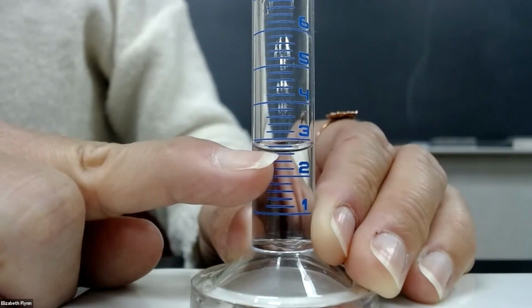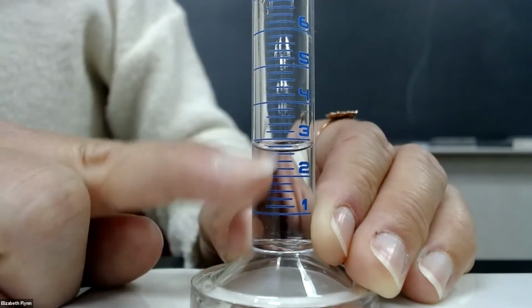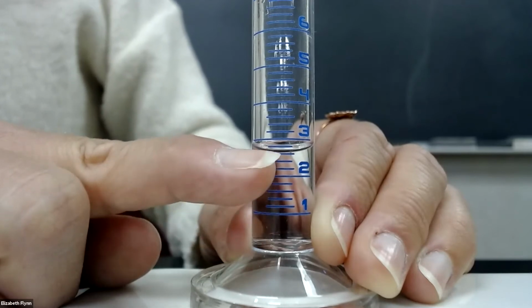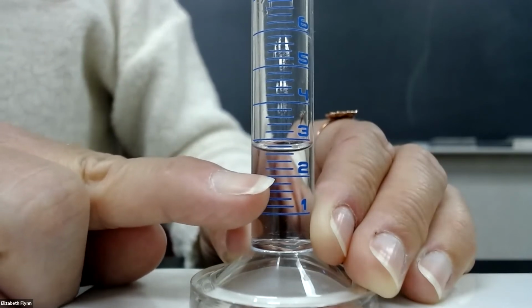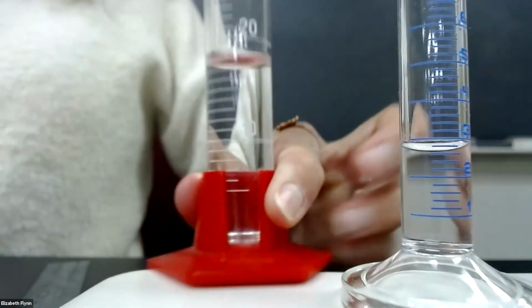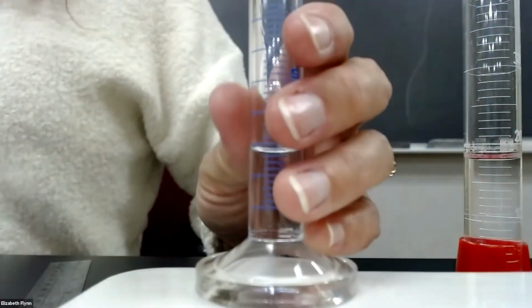2.7, right? But we can't go any further out than that because that's the first time that we are estimating the digit. So these graduated cylinders aren't as precise as other 10 milliliter graduated cylinders. You're still only going to be able to report the 10th of a milliliter. So the measurement that you write down, though, is the one that we had before that was exactly on the line, 2.0. Okay, so both of these graduated cylinders that you have in your lab kit, the 50 mil graduated cylinder and the 10 mil graduated cylinder, are precise to the 10th of a milliliter.